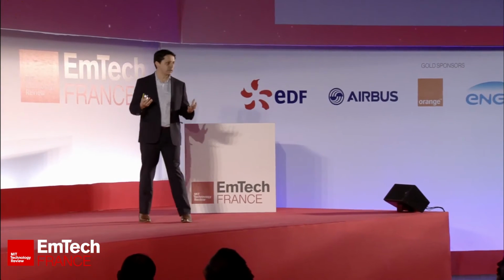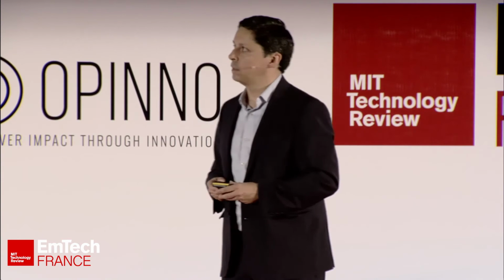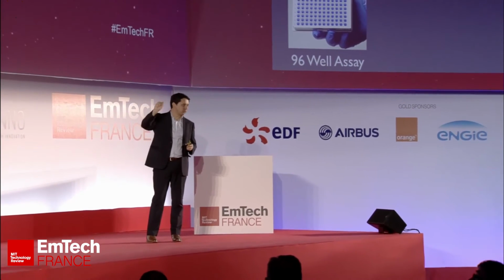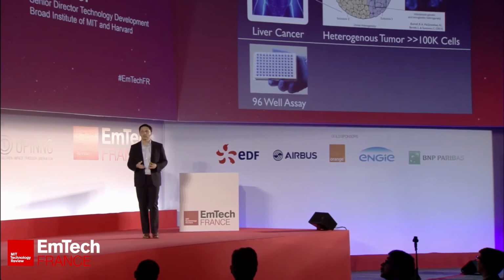But there are still lots of challenges. As our sequencing has gotten cheaper, we're now able to actually sequence individual cells. And cells, for example, in cancer, in a tumor, they're actually not exactly all the same. There's differentiation between different ones. In order to understand that differentiation, these differences, we needed technologies to be able to actually isolate them and take them out individually. This is an example of something that we might typically use in a lab, this 96-well plate. The volumes of reagents and cost of doing each one of those assays in each one of those wells is actually quite high. And for a tumor that might have 100,000 cells, that's extremely expensive.